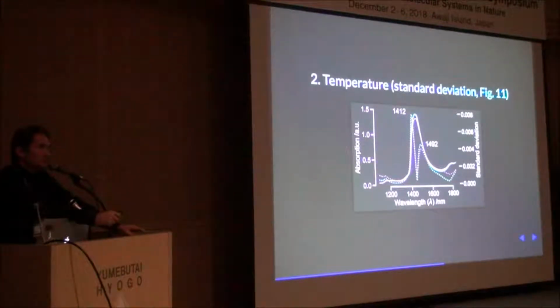The concentration was 1 molar, and then I used serial dilutions to 500, 200, 100, 50, 25, 12, and 6, or something like that. So I just made more or less serial dilutions, and this is the vector that I'm showing you. The reviewers wanted me to correct my experiments and to do more samples and more consecutive spectra. They wanted me to do 10 experiments, with 10 samples in each experiment, and for each sample 10 consecutive spectra. That's what I did for pure water and for each concentration of glycine.